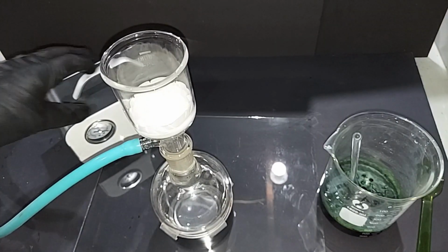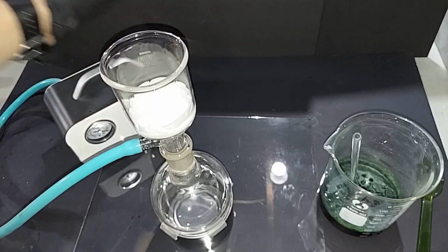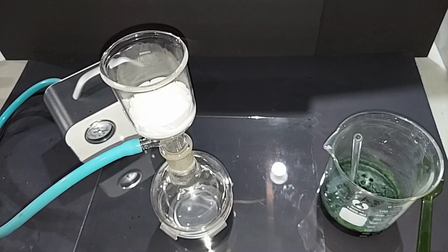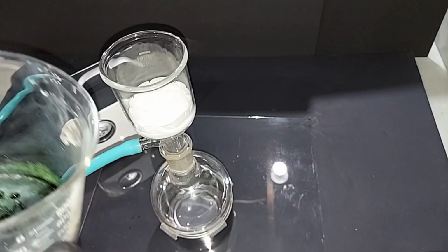Turn on the vacuum filter here. One of these days I've got to get a larger Buchner funnel, but I'll have to do this maybe in more than one portion. And an appropriately colored spoon. Ha!